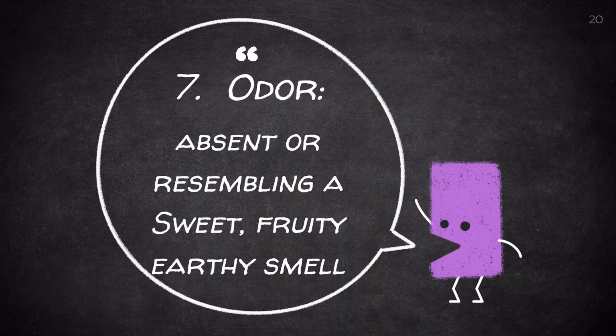For the odor, we focus on the odor of Pseudomonas aeruginosa. It is known to resemble a sweet, fruity, earthy smell.